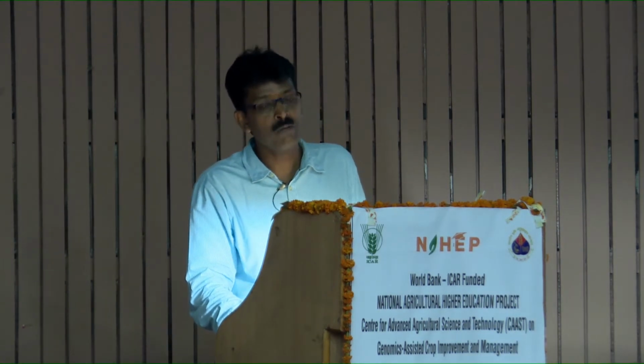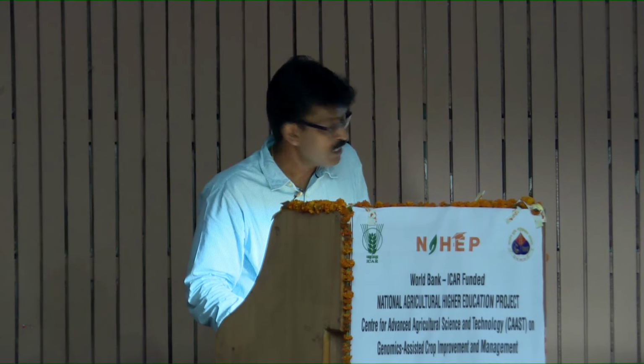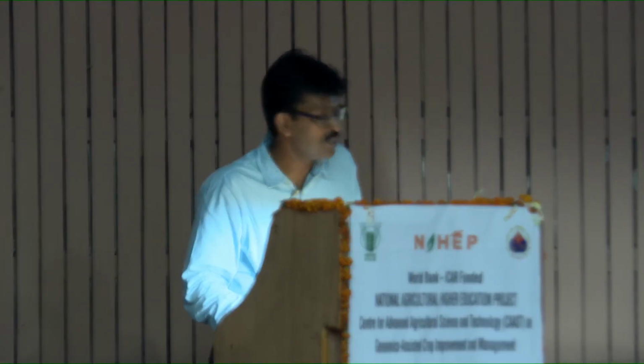So, the purpose of this lecture is to let you know about the historical background of qPCR or real-time PCR, and where we can use this technique in plant pathology in general and mycology in particular. So, the purpose is very straightforward here. The substantial part of this lecture is dealing with the qPCR. And maybe in a couple of slides I will tell where we can use this qPCR or real-time PCR technique in plant pathology. I am Dr. A. Kumar, Principal Scientist in this division.